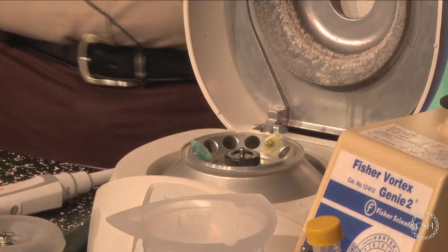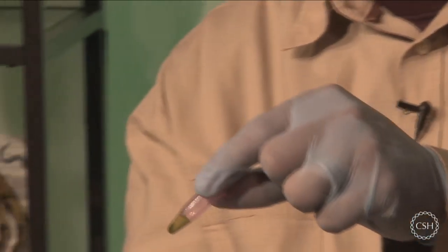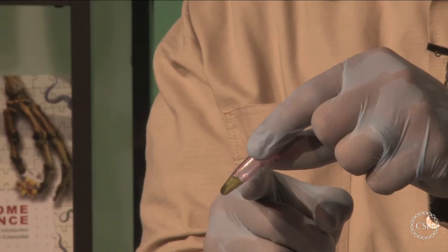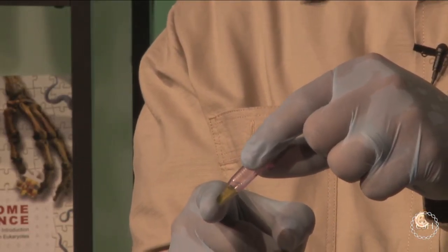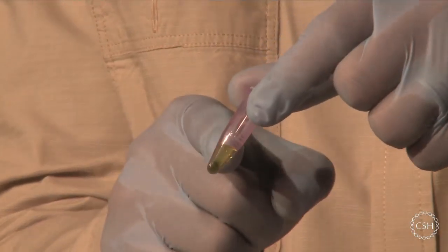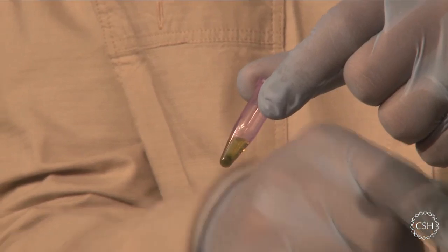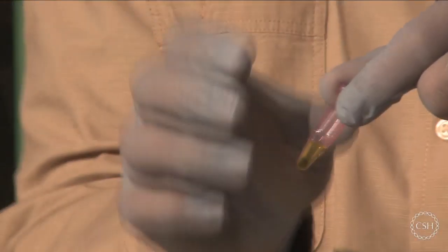So I'm going to take my first test tube out, and this is my sample number 1, and I only want to take 150 microliters of the clear lysate, which is here. So you can see the debris at the bottom that we mentioned previously. And you can see the supernatant, which is clear on the top. Now it's not going to be completely clear, but it's actually free of debris. Okay? And I'm going to go and grab 150 microliters of that.